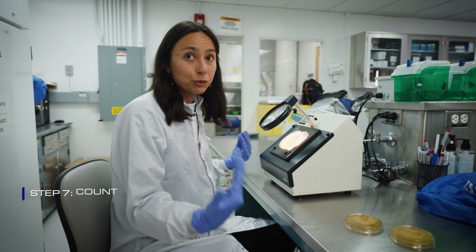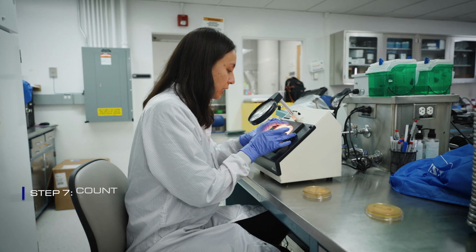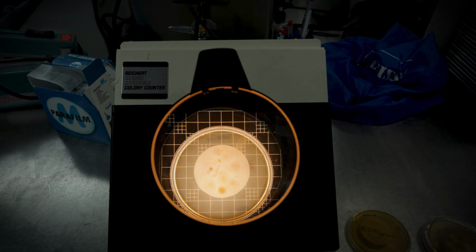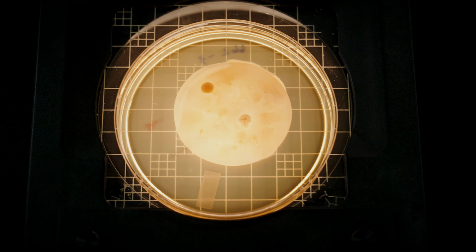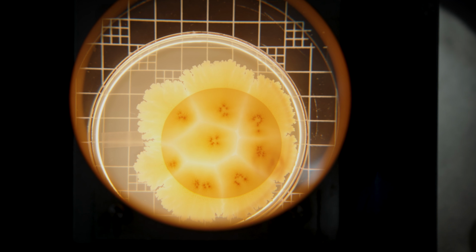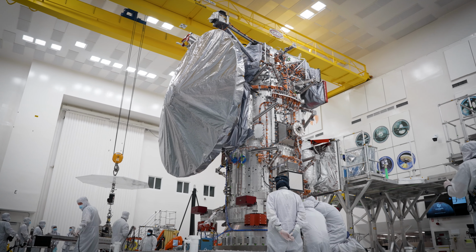This is where we're sitting when we're counting the colonies. So we would sit here and you're able to see pretty closely. They are really diverse, actually. They come in different colors. They can be tall and ridgy or really circular and smooth. Some of them really spread out. We use that number to estimate the number of microbes living on the spacecraft.